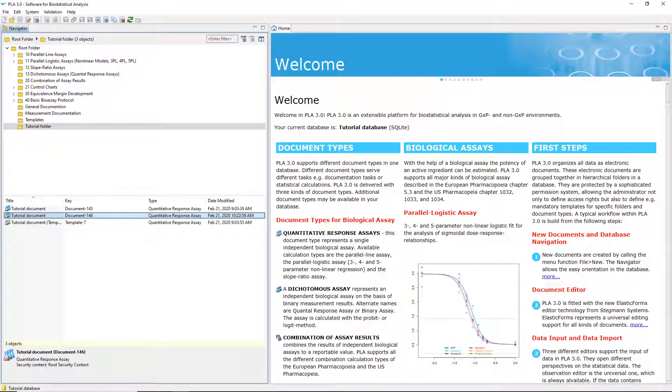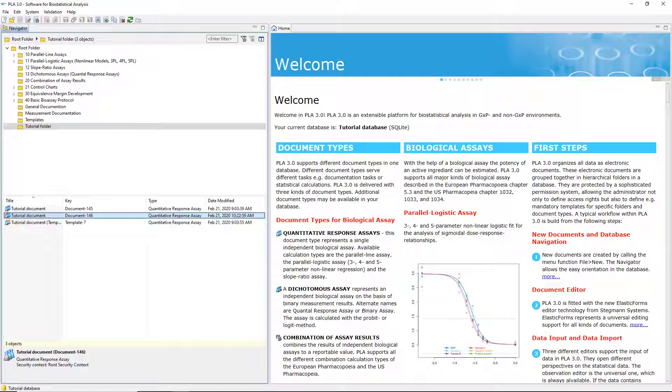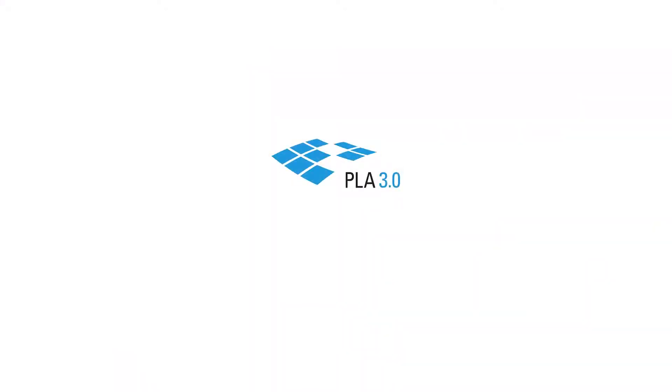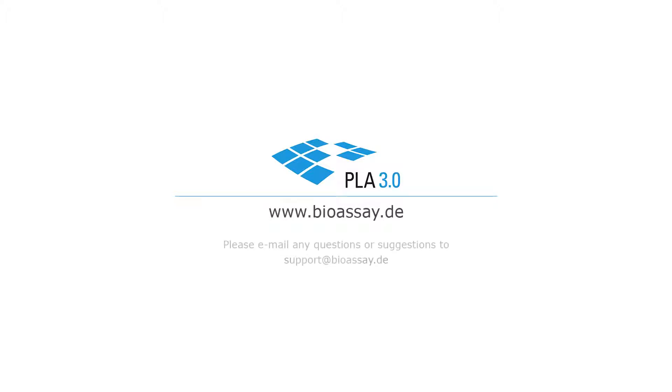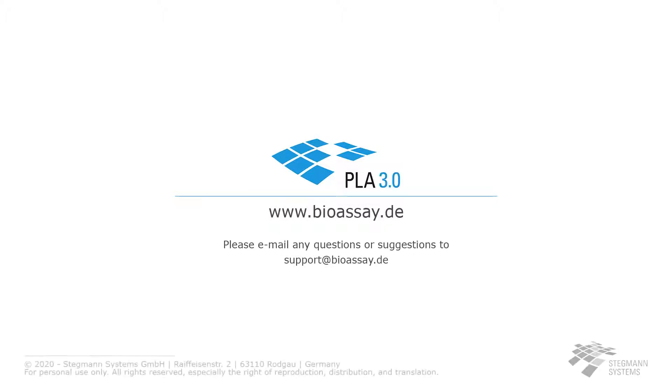To learn more about documents, you can experiment with creating assays. Take a look at the configuration and data of the demo assays, calculate them, and generate reports. The features you need to perform these tasks are available in the editors, which are displayed in the document pane on the right in PLA. Enjoy your first steps in PLA 3.0. If you want to know more about working with documents, please consult our videos on this topic and our help pages.